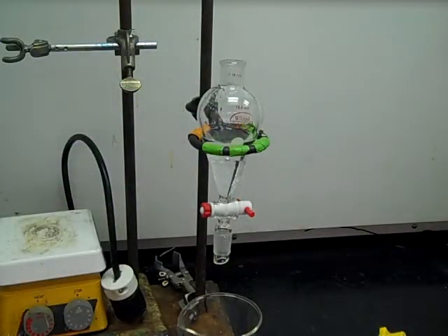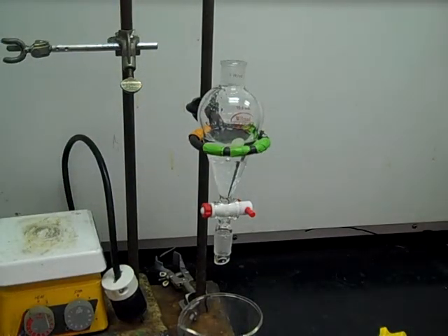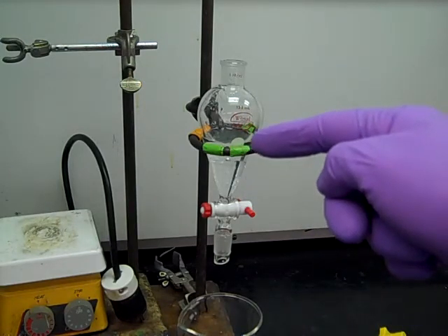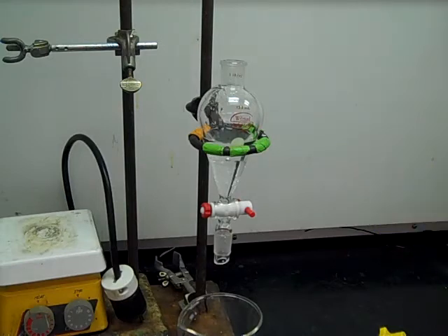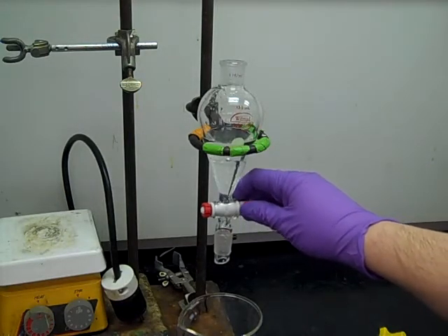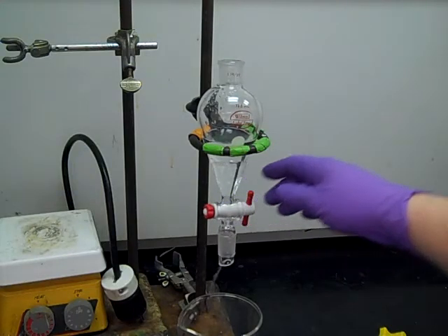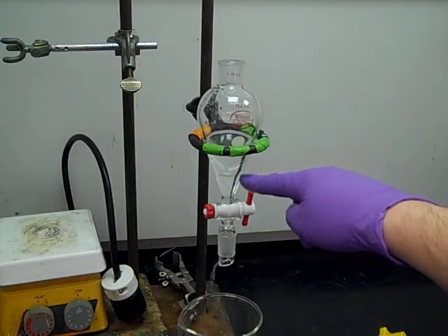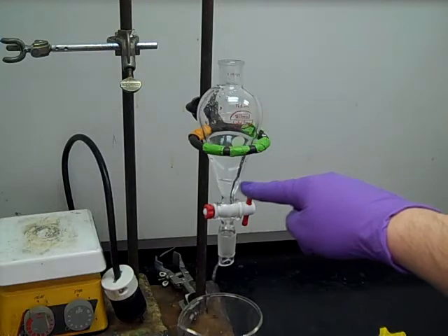All right, so now we're going to separate our two layers. We've got a new beaker down beneath, and then we've got our organic bottom layer, aqueous top layer. So by opening up the stopcock, we're going to release that bottom layer. See how I've got the separatory funnel in a ring stand. So you can notice that bottom layer dropping further and further, the interface line.